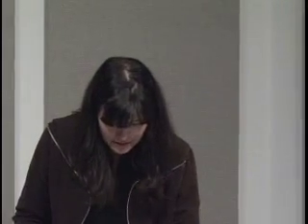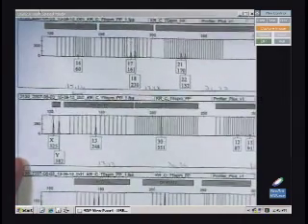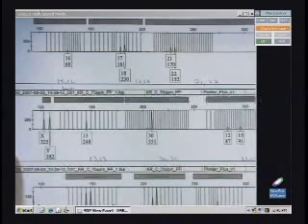So let us look at some of the actual data. Kelly had cut 75 sperm cells on Wednesday. And the writing underneath, those are the actual types they should be of the sperm donor. And the first thing I noticed right off the bat, and I wonder if I can still use this pen on here. I'm going to see. Will it work? Yeah.